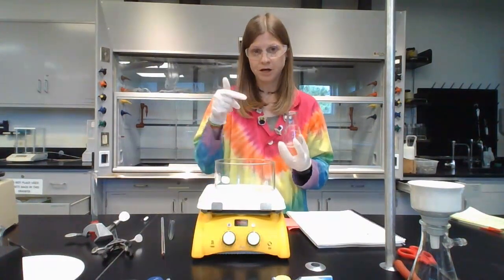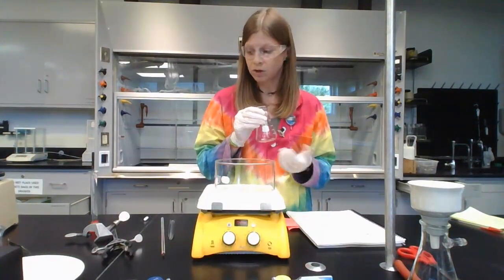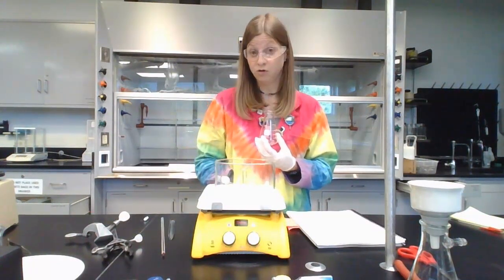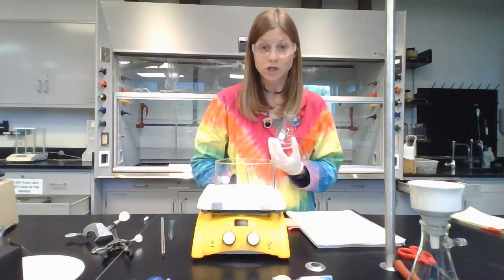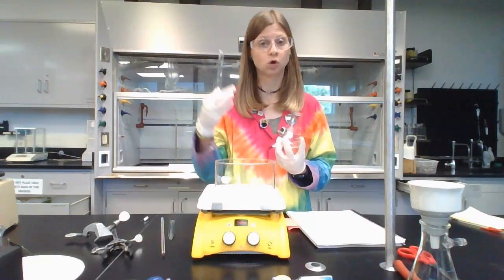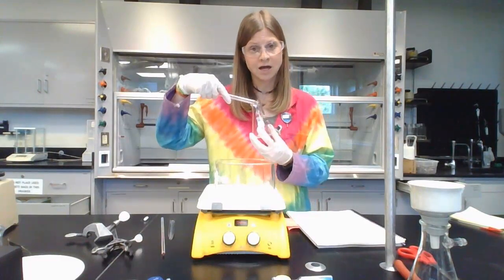Okay, so backtracking. We put 3 grams of solid in here. We needed to add one of the reactants, which is acetic anhydride. Acetic anhydride is a liquid. You're going to be measuring out 6 milliliters of it using a 10 milliliter graduated cylinder. Acetic anhydride is harmful. You will read the safety data sheets and answer the safety questions before you're allowed to do this lab, so you will know that. So we're going to make sure we work with this under a fume hood or snorkels, and we're just careful with it. We have our gloves on. Okay, so measuring out 6 milliliters, and then you'll transfer that on top of the salicylic acid.